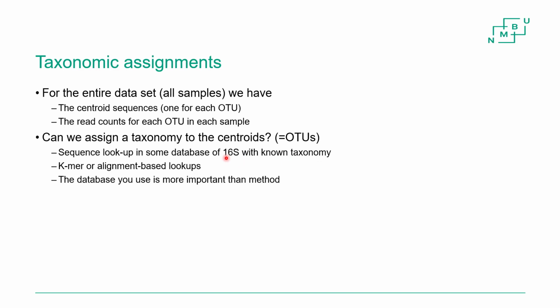This is quite similar to what we actually did in module 9 with full metagenome sequences, where we have reads, right, from all around the genomes. We used Kraken, or we used Kaiju or MetaPhlAn. All these methods try to take each read and assign it to some taxonomy.